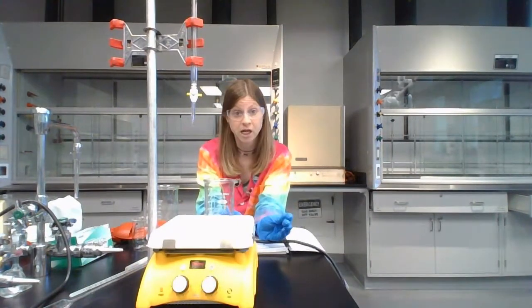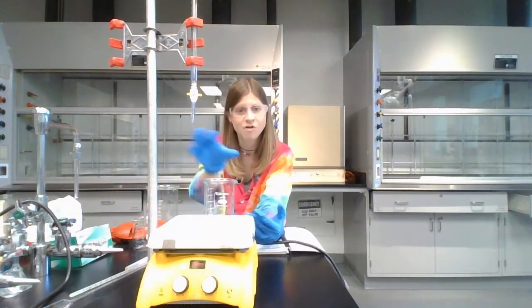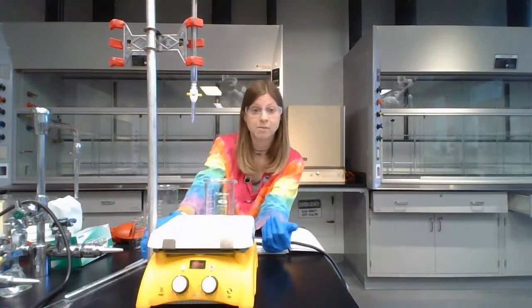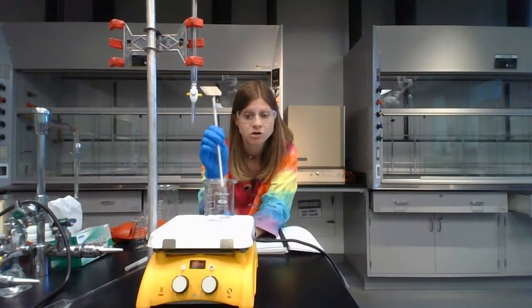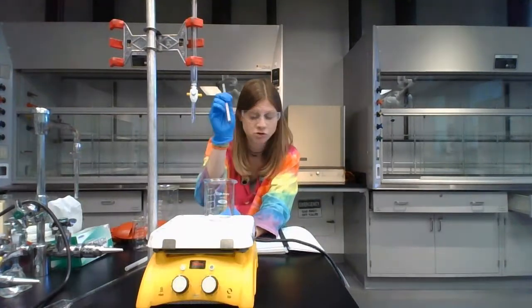So you're going to have to turn on your hot plate. Especially at the beginning, I would get trial 1, trial 2, and trial 3 all prepared for part B and have all three of them sitting on the hot plate so they can all be warming. You're going to use your thermometer to periodically check the temperature. Remember, don't let the thermometer touch the glass anywhere. It's suspended in the liquid to measure the temperature.